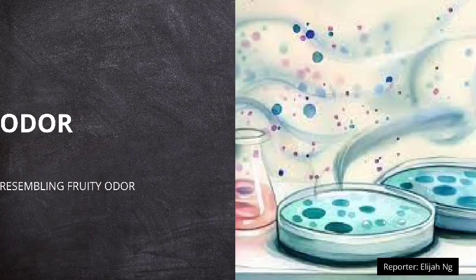Now, for the odor of agar slants, it usually resembles a fruity odor. And so why do some bacterial cultures have odor? Some microbes produce a characteristic smell, which sometimes helps in identifying microbes. The actinomycetes actually produce an earthy odor, which is often experienced after the first shower or rain. And many fungi produce a fruity smell, while E. coli produces a fecal odor.